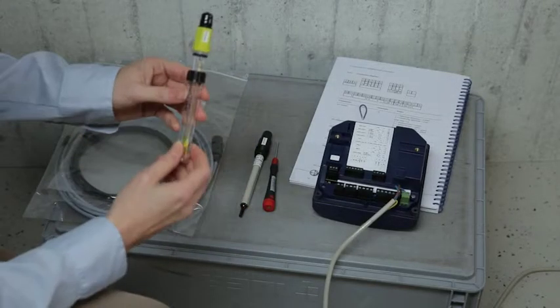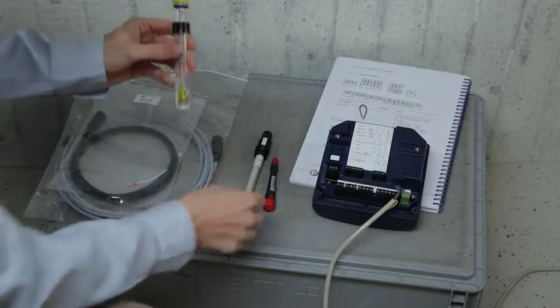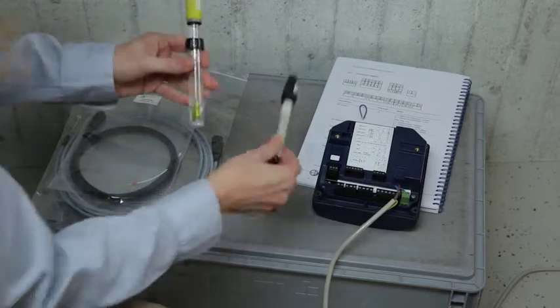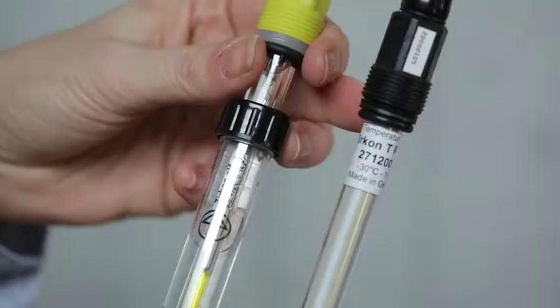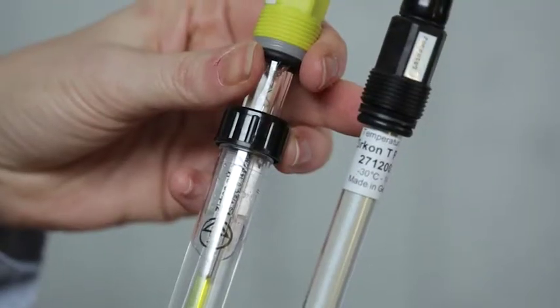In this film, we show you the wiring of a pH sensor with separate temperature sensor.